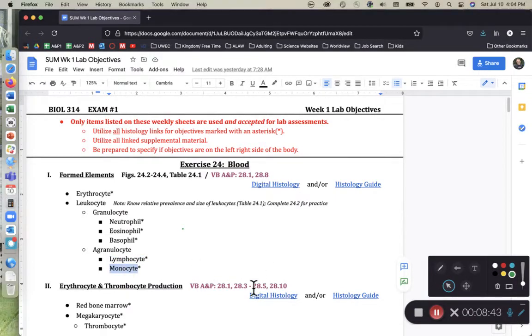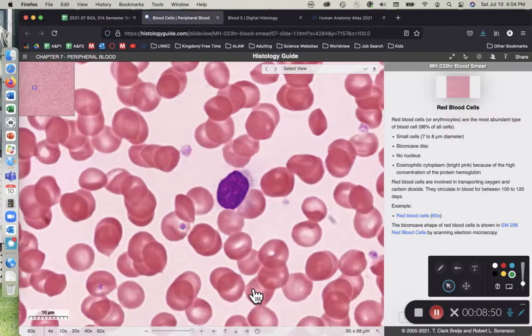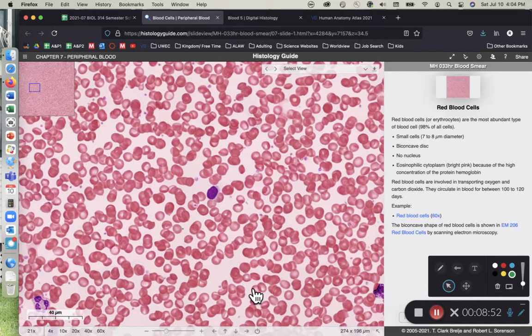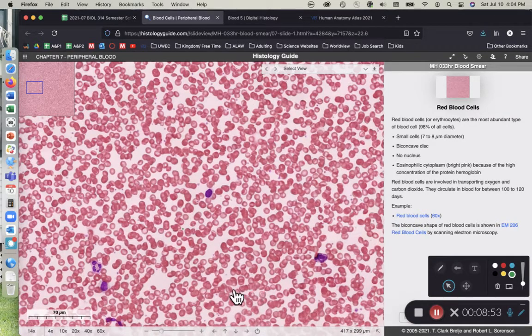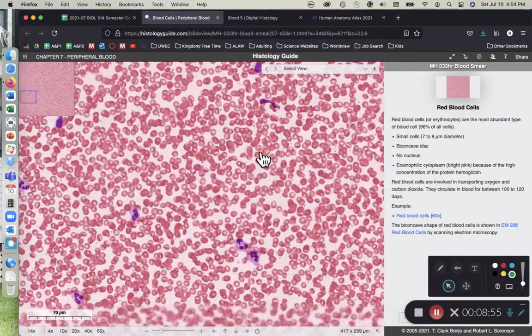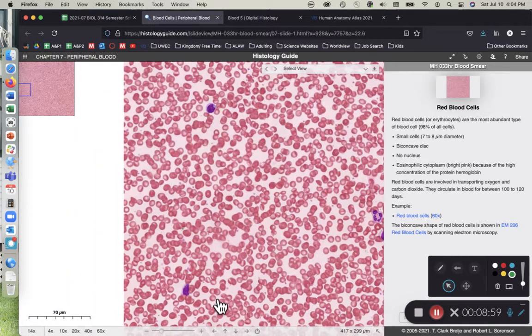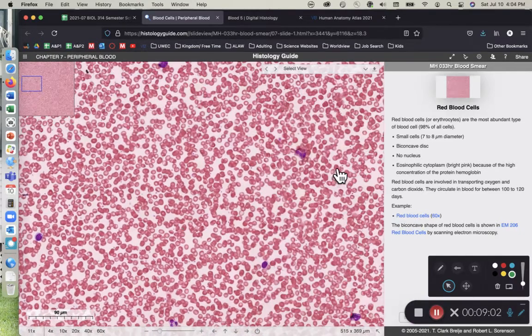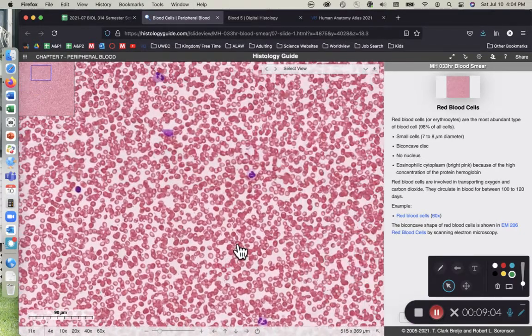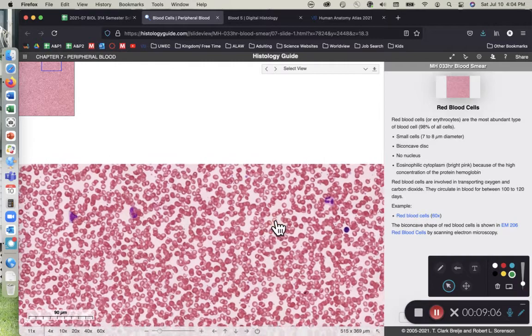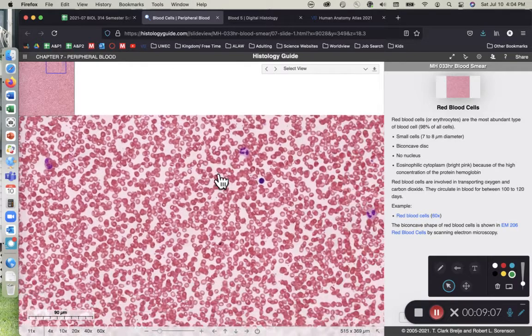Let's move on to monocyte. The monocyte is characterized by being a very large leukocyte, or a very large white blood cell. They're not terribly common, but we can find them if we look around.